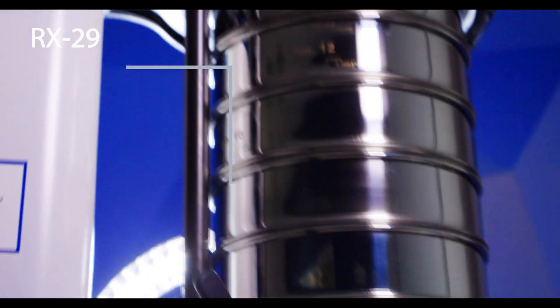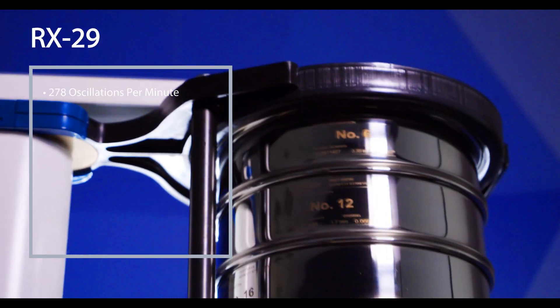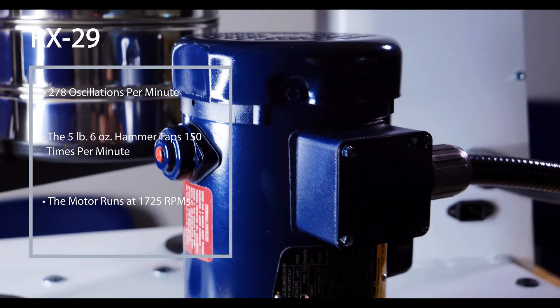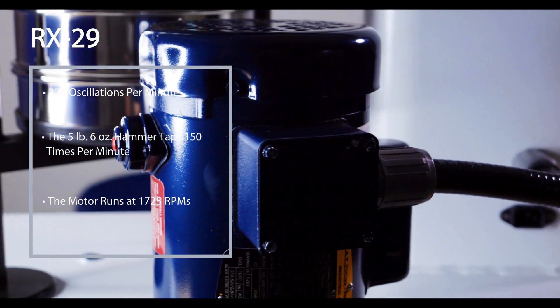These specs include: the RX-29 will oscillate 278 times per minute, the 5-pound 6-ounce hammer will tap 150 times per minute, and the motor runs at 1725 RPMs.